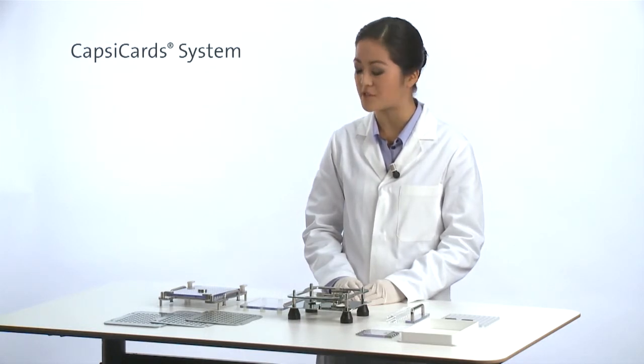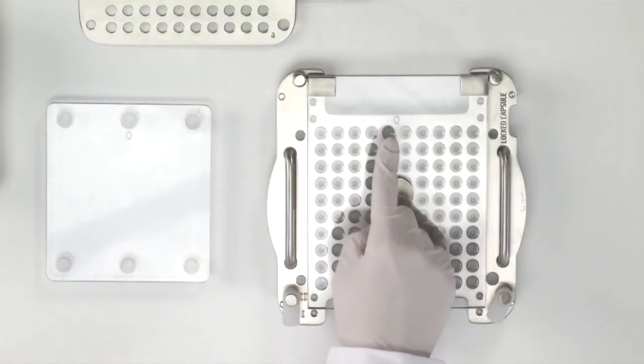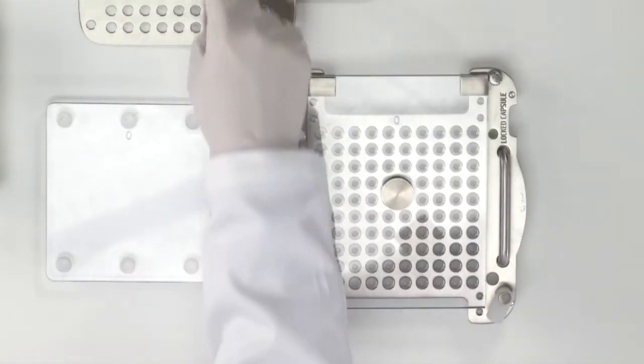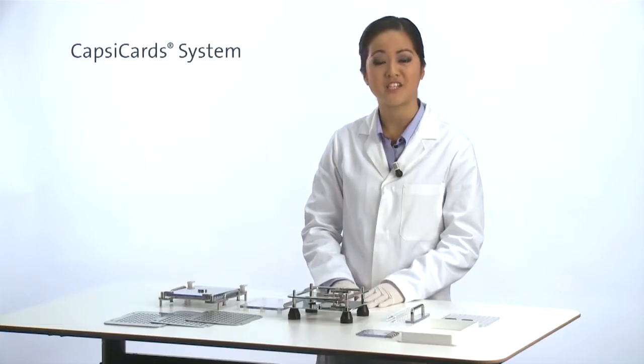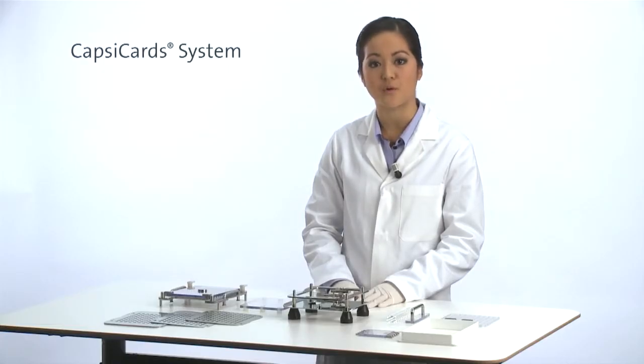You can check for the capsule size number on the caps tray, on the spacer plate and on each of the 3 body sheets. You can check for the capsule hole number by counting the rows of holes.